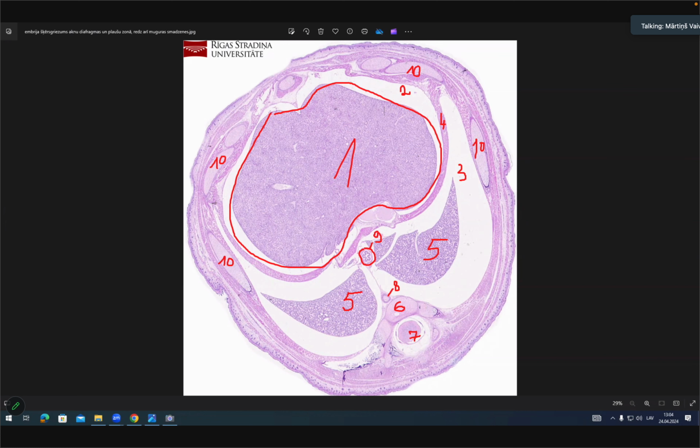In this case, only rat embryos are cut like this. No human embryo looks like that under the microscope. Most are rat embryos.